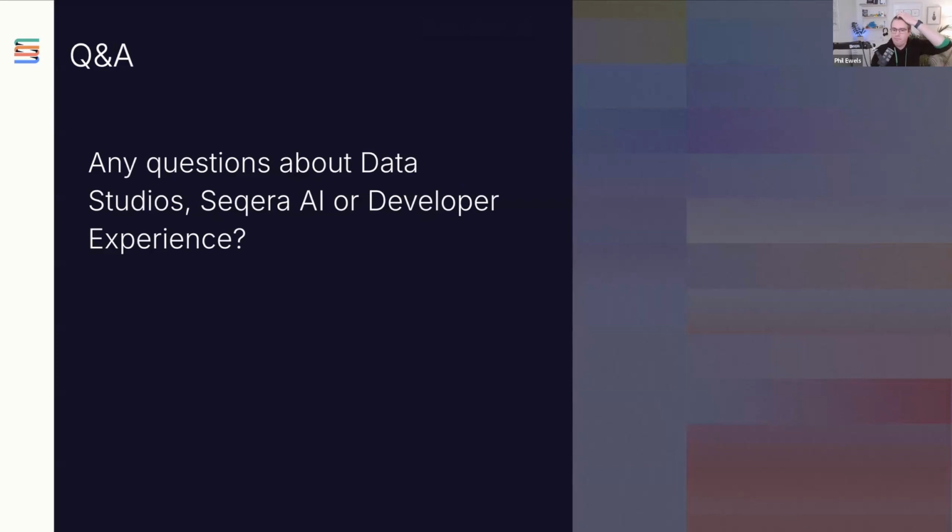I think I'm going to run, so maybe Rob and Sasha, you guys can unmute yourselves. That would be great. And we'll start firing some Q. I've seen a lot of questions come in already, and I think quite a few have been answered in text already. And I'm going to give one to Sasha and Rob while I read up on the others. Some of these have been answered already, but I'm going to just throw them out anyway.